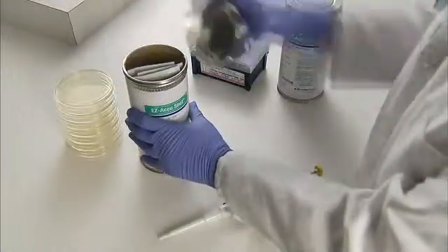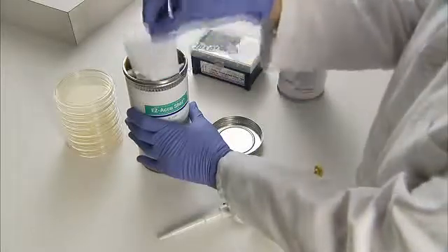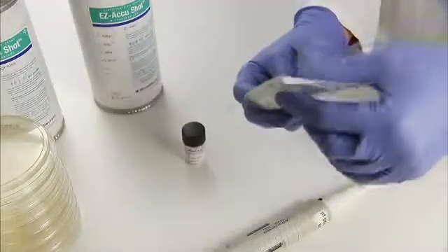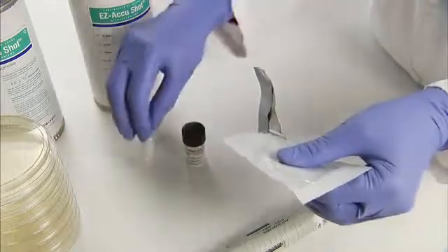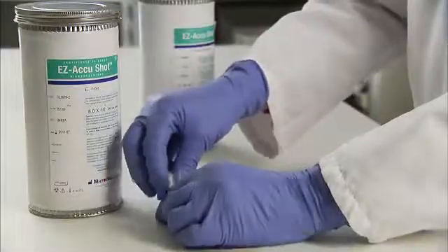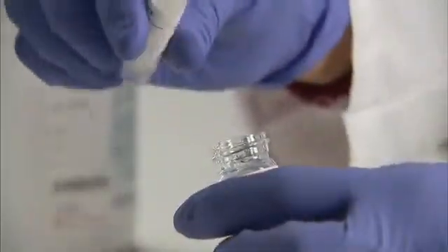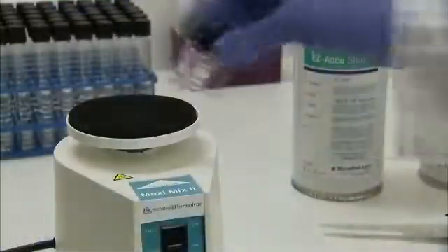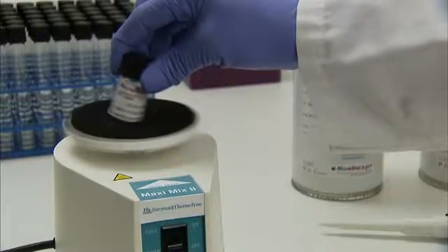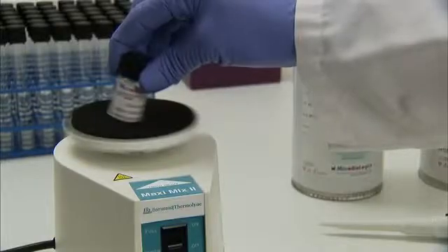To begin, simply remove 1 hydrating fluid vial and 1 foil pouch containing the lyophilized microorganism pellet. Remove the vial from the pouch. Allow the unopened vials to equilibrate to room temperature. Tip the microorganism pellet into the 1.2 milliliter vial of hydrating fluid. Vortex the hydrated material for a few seconds to achieve a homogeneous suspension. The pellet dissolves instantly.